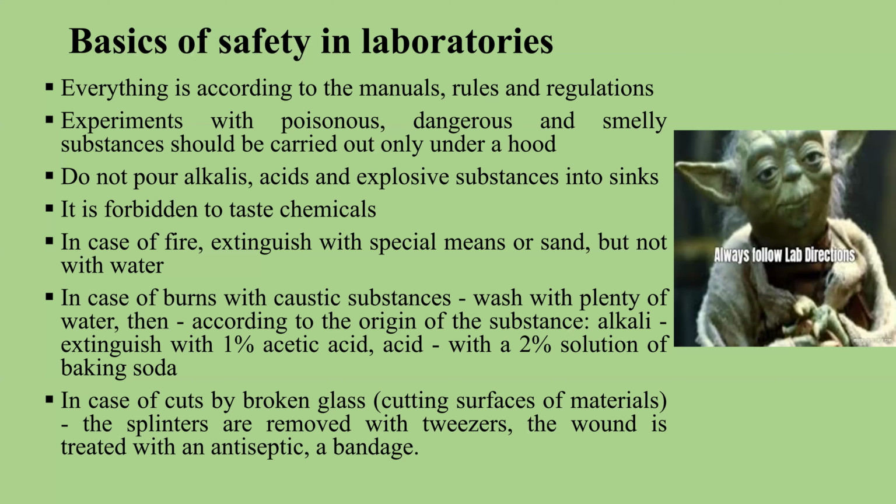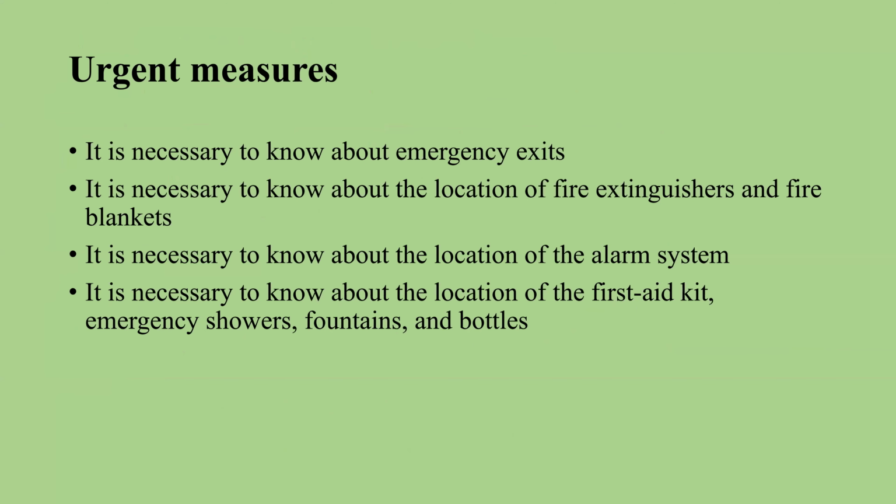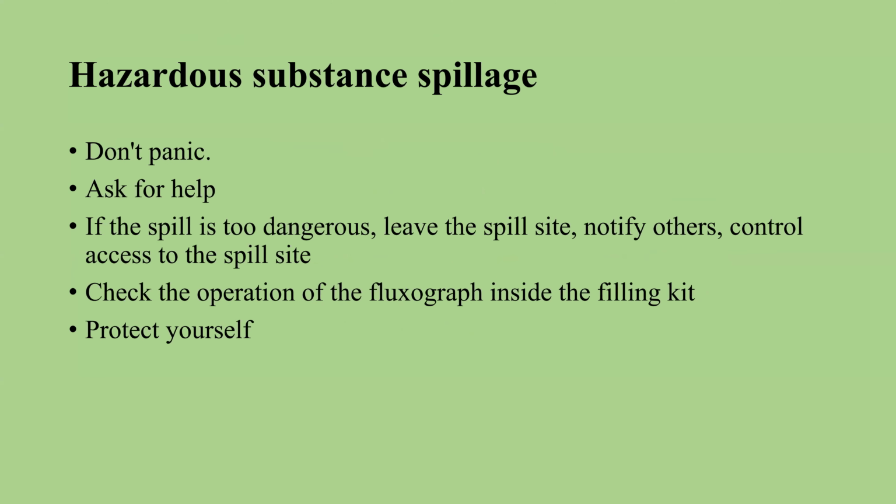Of course, the normal rules in case of emergency: again, I repeat, know the emergency exits and the location of fire extinguishers, fire blankets, the alarm system, the first aid kit, and showers, etc.